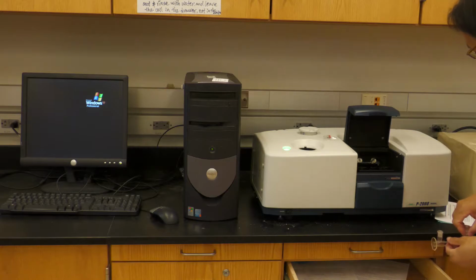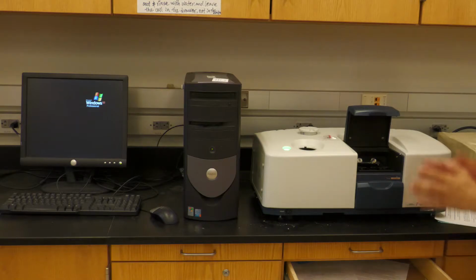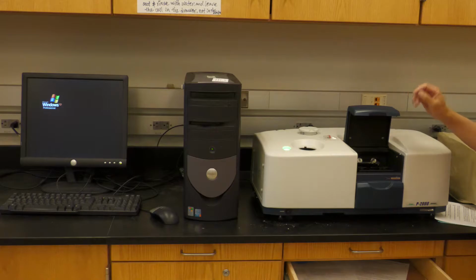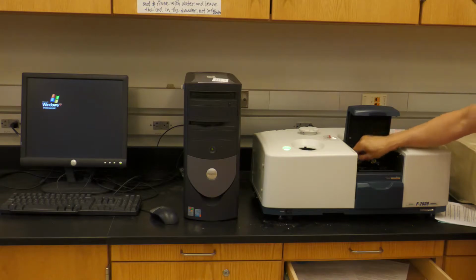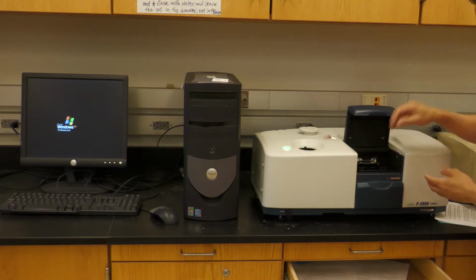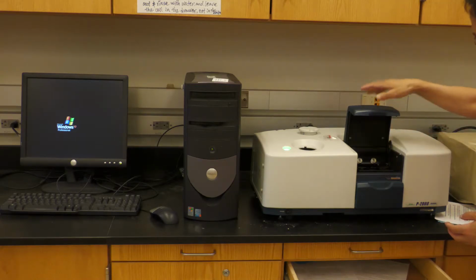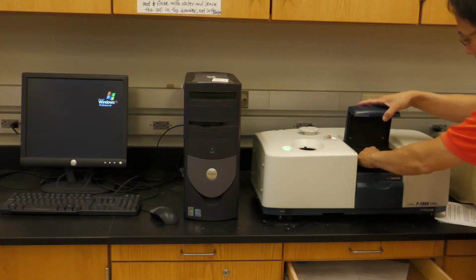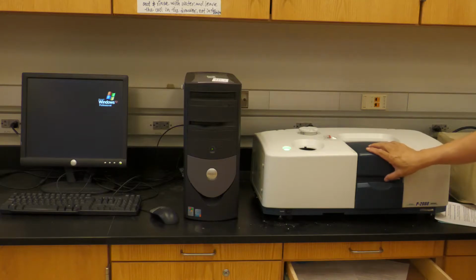Okay. Now in this experiment, we will do two parts. The first one is how they change with respect to the concentration. The second one is how they change with respect to temperature. There is a temperature sensor here, and in this compartment, we can change the temperature a little bit, heat up a little bit. So the temperature sensor, we put it inside. So when you cover this one, we can heat up a little bit. We can use a computer to control this one.